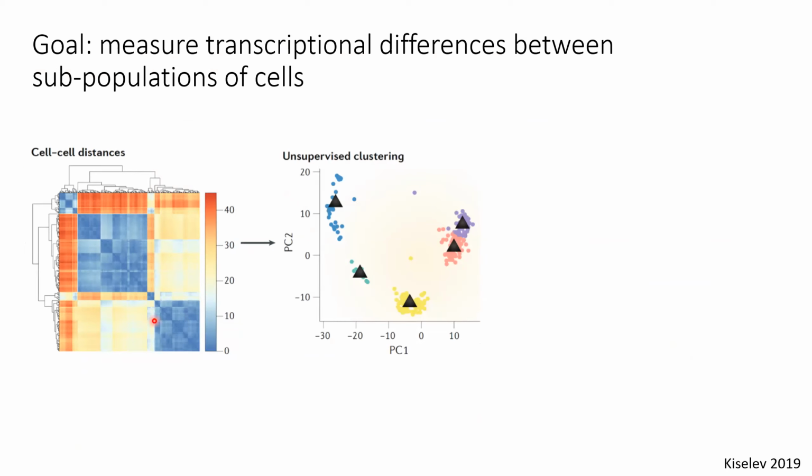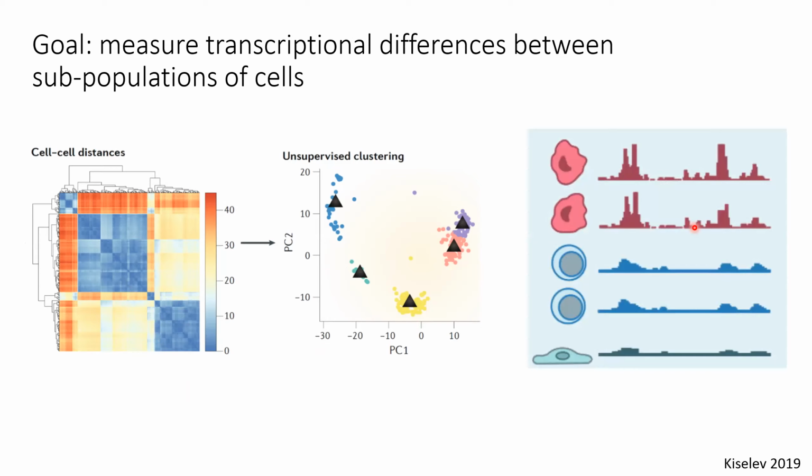So feature selection is motivated both by the curse of dimensionality and the idea that we can model technical variation to identify a basis of biologically varying genes. And the biologically varying genes somehow combine to give rise to different expressions of cellular identities. And we use unsupervised clustering approaches to try to find groups of cells that vary in similar ways. So once we have these groups, we can quantify how their transcriptomes differ and use these gene distributions as inputs for further computational or wet lab experiments.